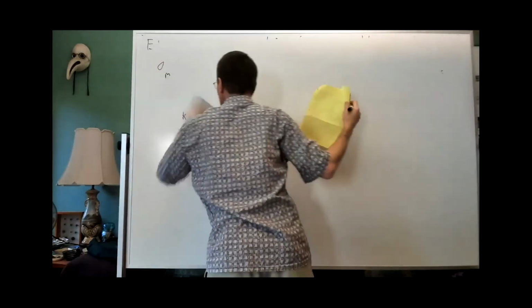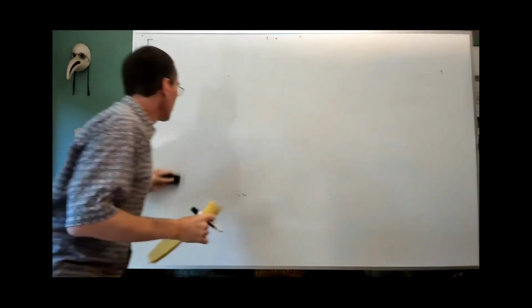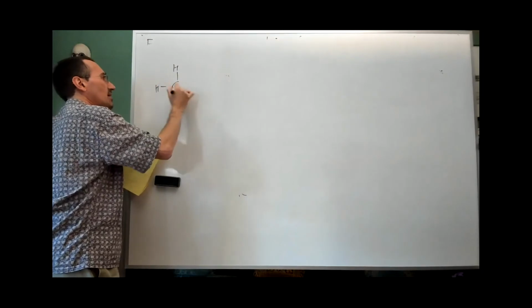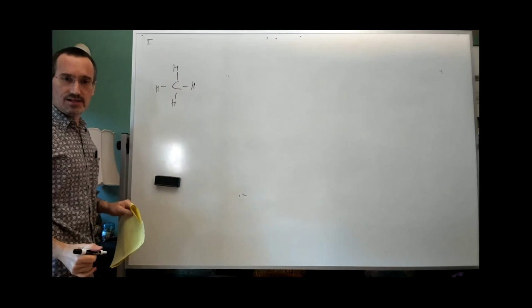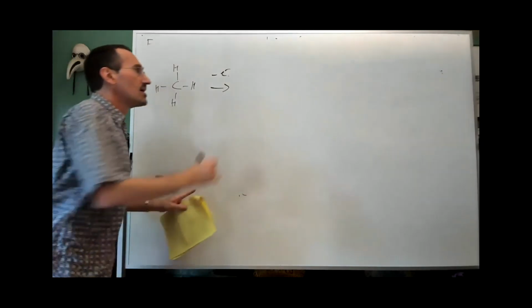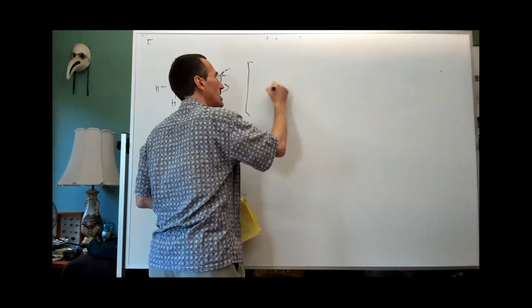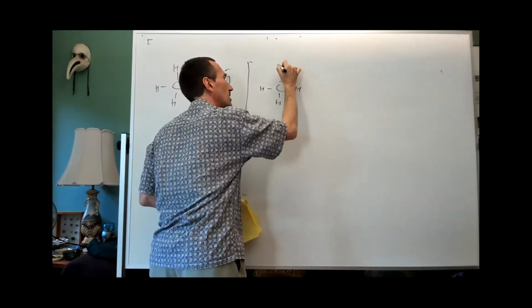All right, so let's take the simplest of organic molecules, or one of the simplest of organic molecules. So let's take methane. And we're going to go ahead, we'll take away one electron from it. So that means we can think of there being 4 resonance structures that share the pain.